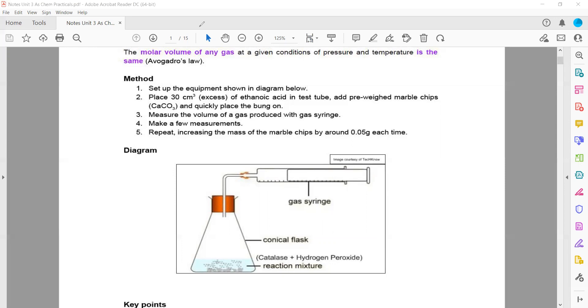Place 30 cm³ of ethanoic acid in the test tube. Add marble chips (CaCO₃) and quickly place a bung. You can also use hydrogen peroxide, which decomposes into water and oxygen. Any reaction that emits gas can be used to determine molar volume.